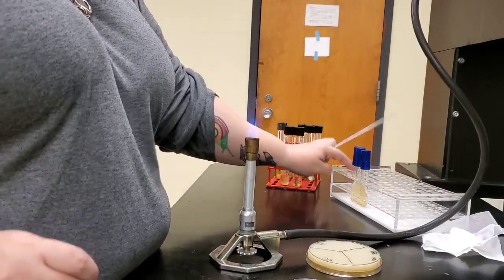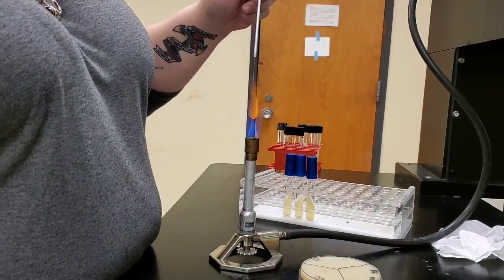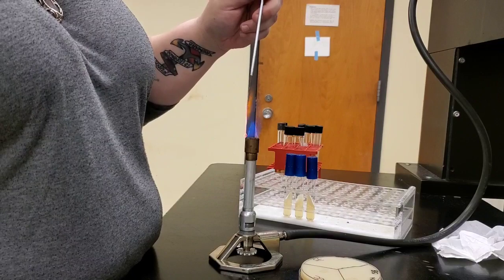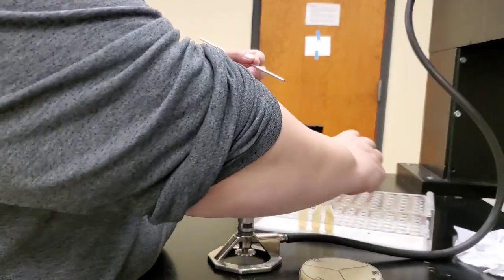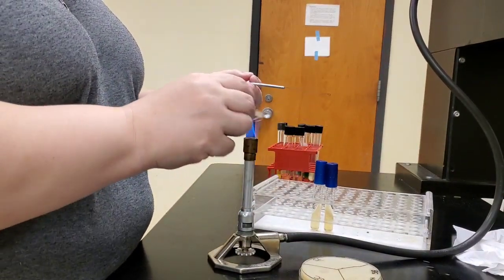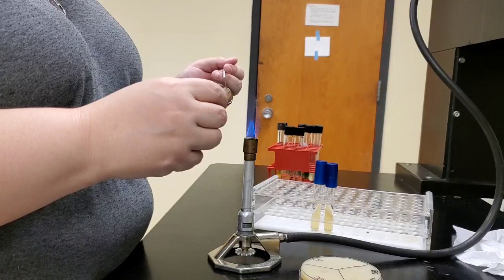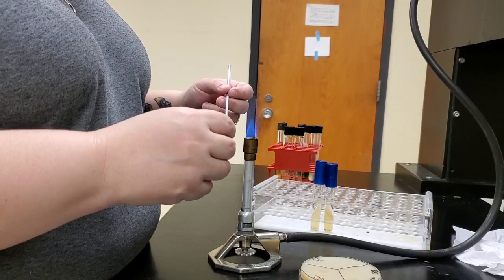So using aseptic technique, we're going to inoculate each of these sectors with our inoculating loop. Of course, you sterilize the loop, let it cool down. Even though we're not working in a physical lab space anymore, we still want to be familiar with the aseptic techniques that you have learned so far.